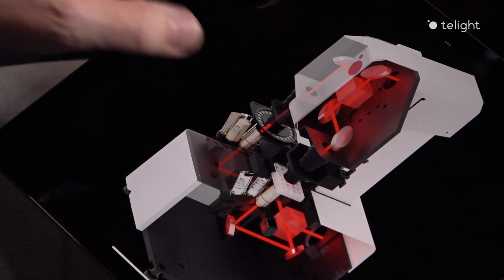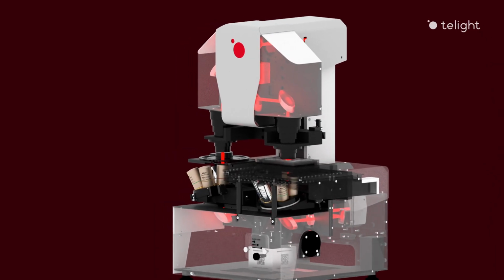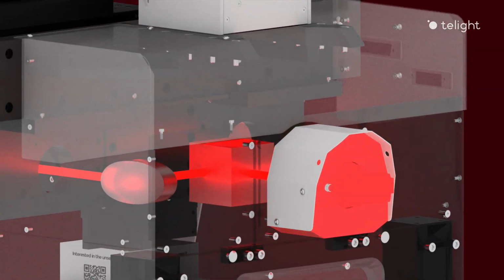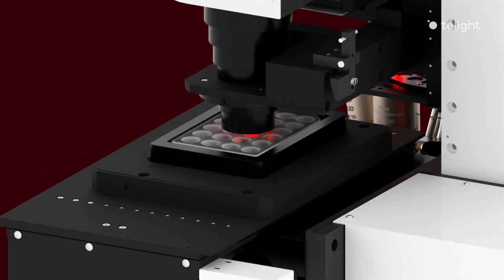Can you give us a short description of the Q-phase light path that we see here? The microscopes we design actually consist of two microscopes with condensers, objective lenses, a detector in the output, and the table of the specimen.